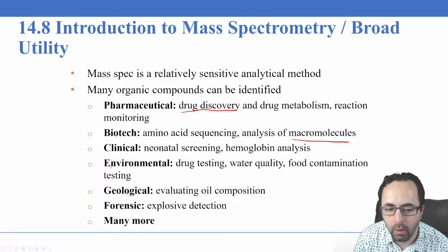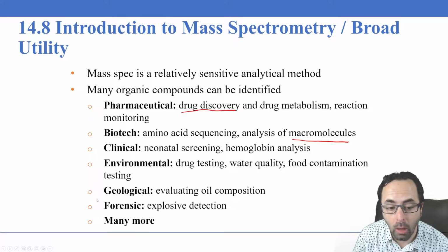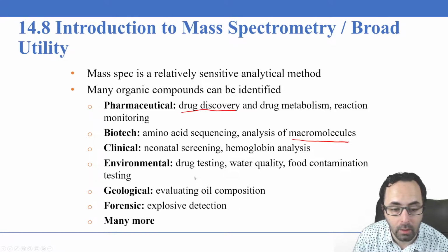And you can see there's a lot of other situations in which mass spectrometry will be used. It's a very useful technique for identifying molecules in many different job environments or science environments.